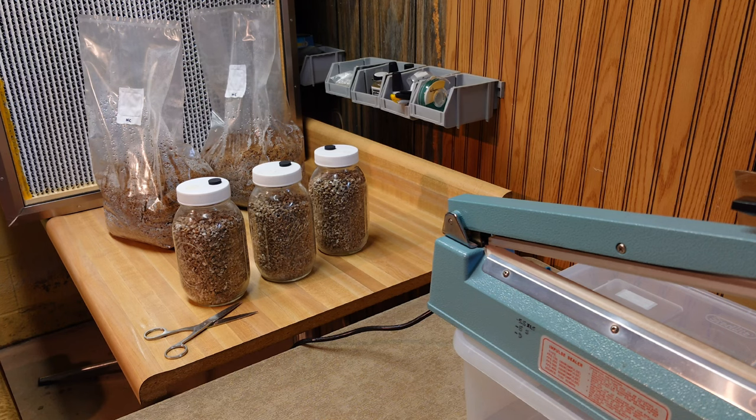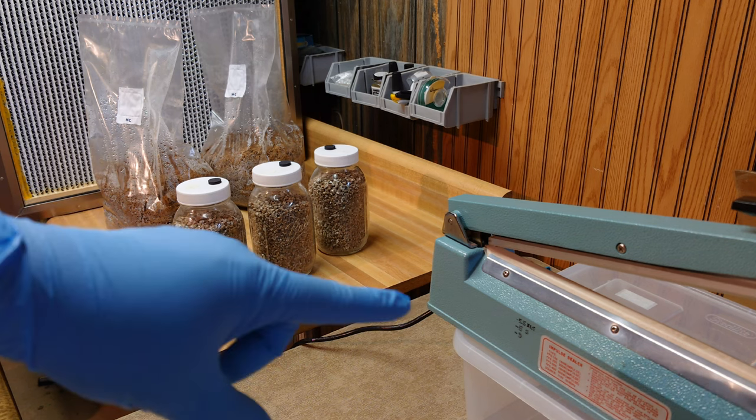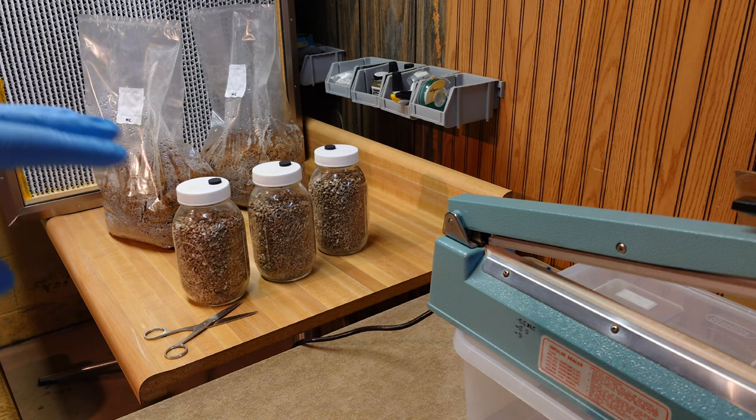We are set up in front of the flow hood with everything we need to inoculate our bags. We just have two bags here - holding one back because of space. Our bags are pasteurized and sealed. We have our three grain jars. What we're going to do is take our scissors, cut the tops off the bags just below the seal, shake up the grain jars to break those kernels up, then dump one quart jar into each bag. Once grain is in all three bags, turn the flow hood off, give them a little squeeze to check for leaks - the best way is to listen for a pinhole. No leaks - give them a good shake to evenly distribute all that spawn.